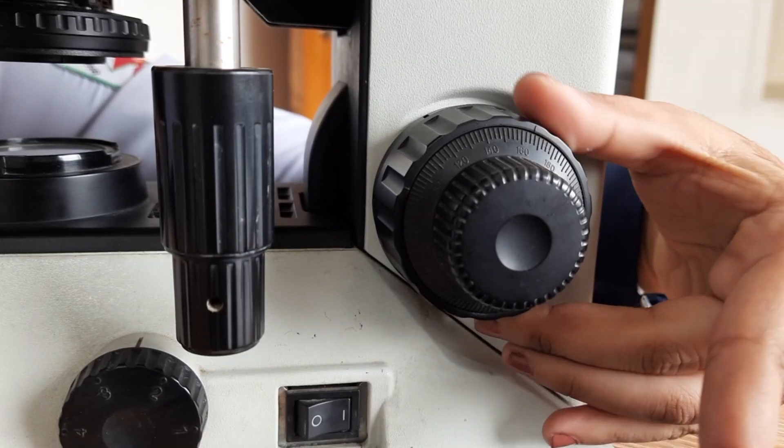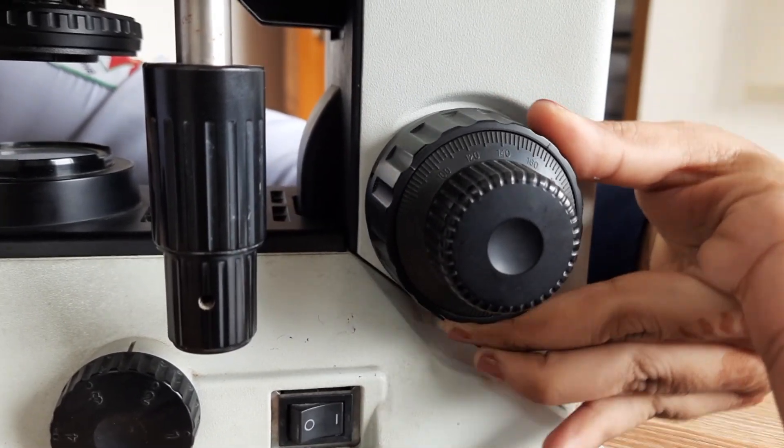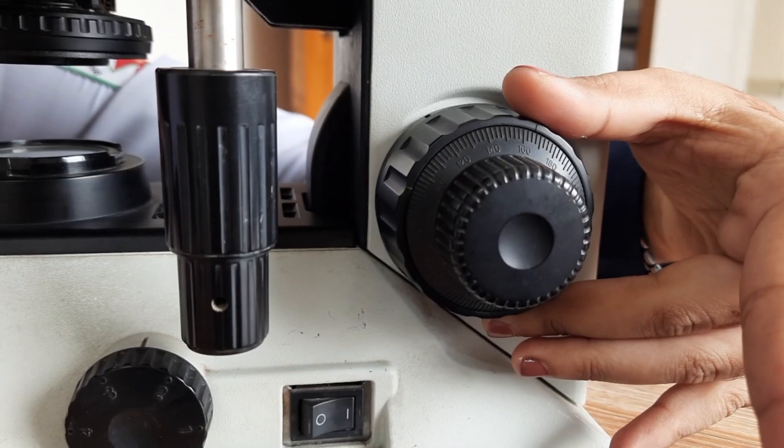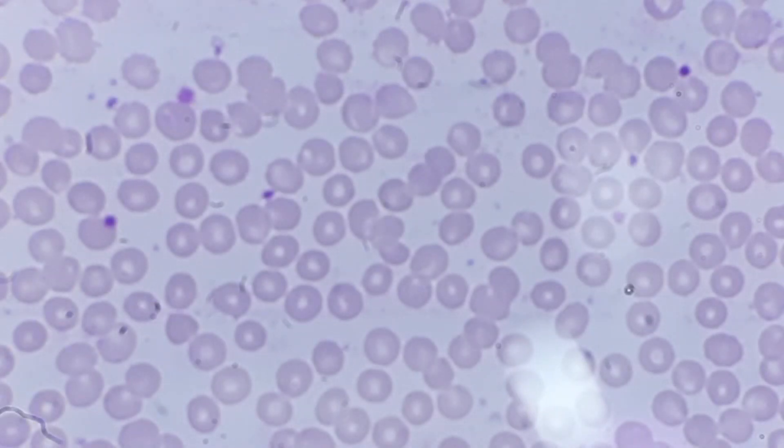To sharpen the image of your specimen, you use the focusing knobs. The coarse adjustment knob is for rough focusing and the fine adjustment knob is for fine-tuning the focus.